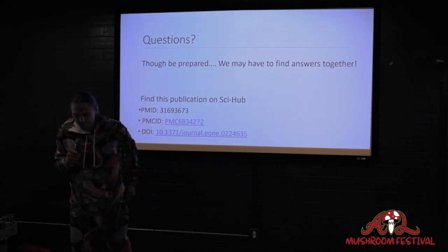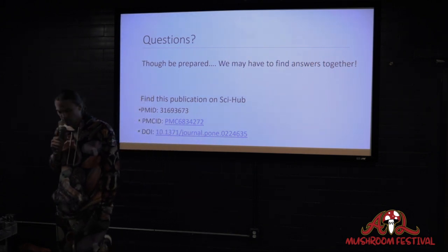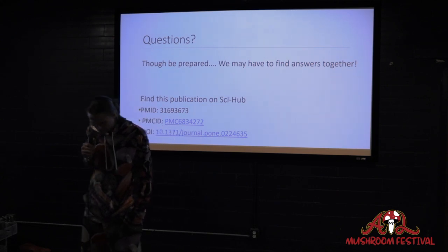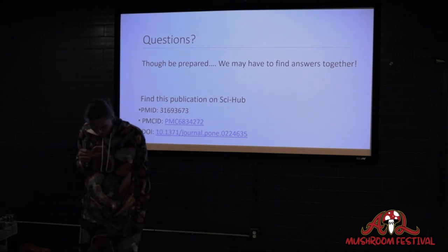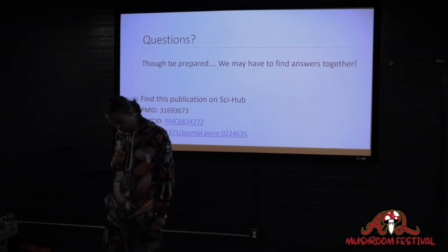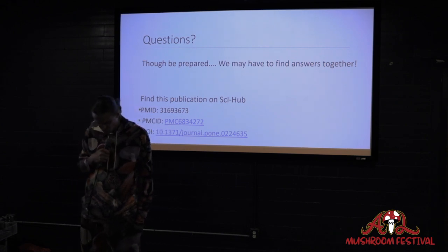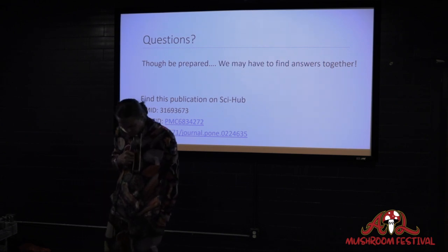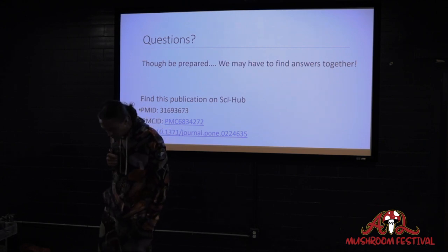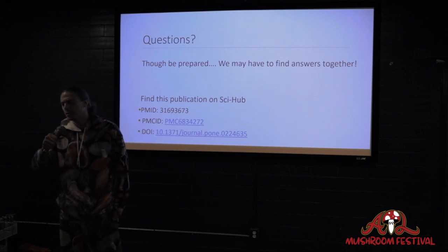Let's do it. I'm really interested in the resampling location that you're choosing. Yeah, sure. With the idea being that we want to grow mycelium through the agar to leave the bacteria behind. Correct. If we're pulling from the edges and not from the roof of the cabin, sure. I've seen mycelium lift the lid of a monotub. Is the mycelium not just lifting the lid of the cabin and coming out that way? No, not generally. No, because it's all mycelia at that point.